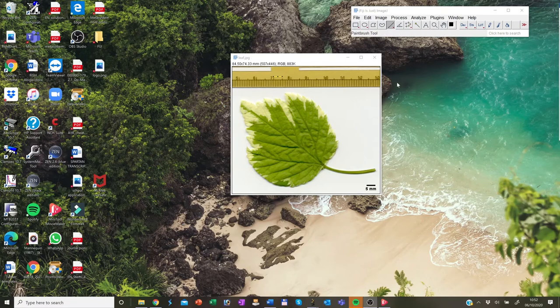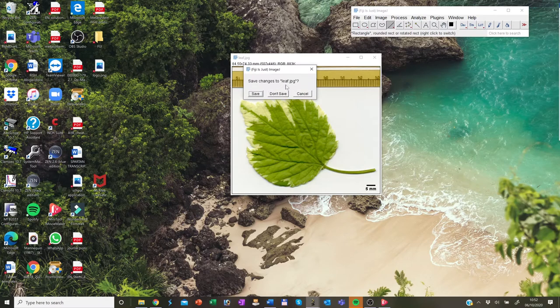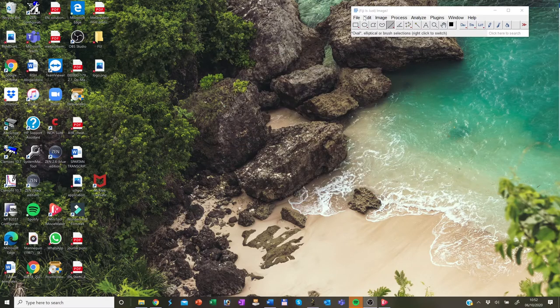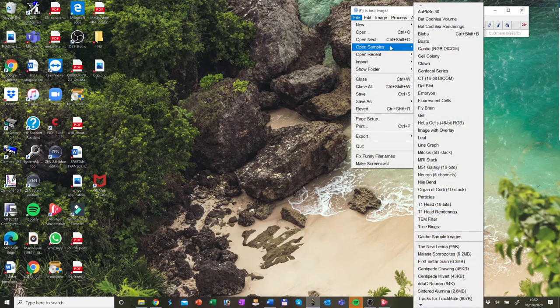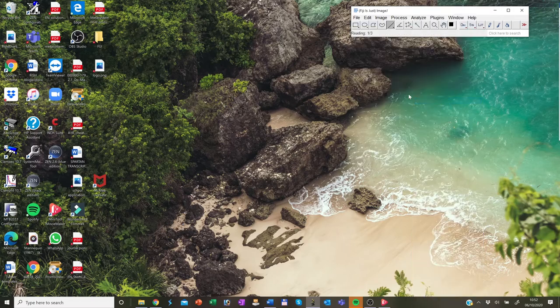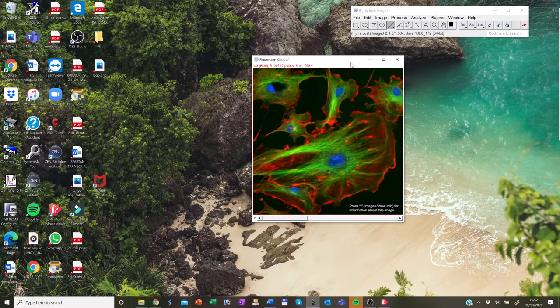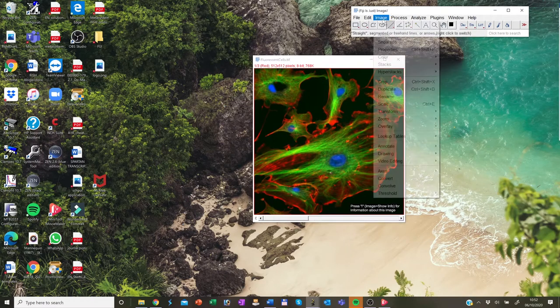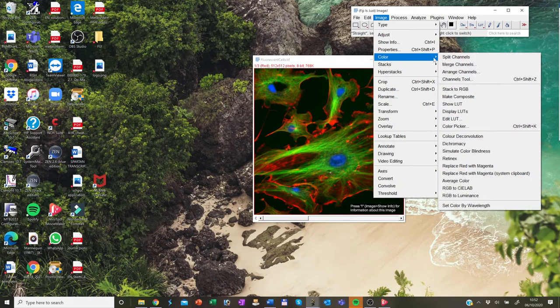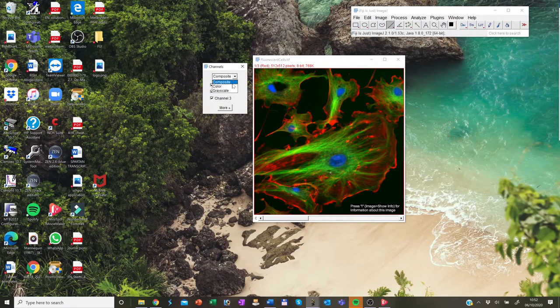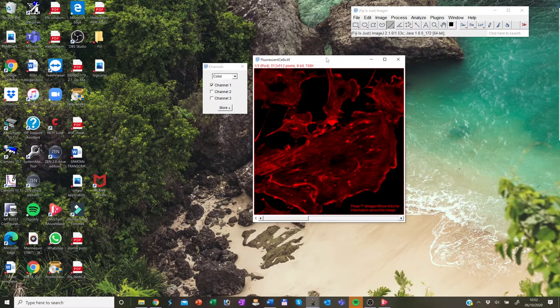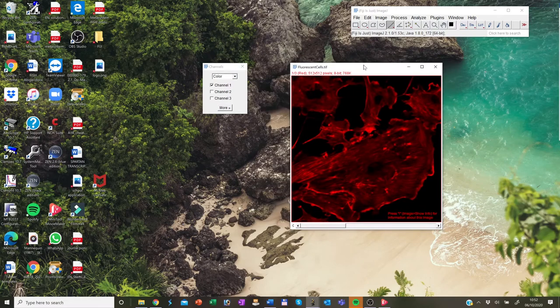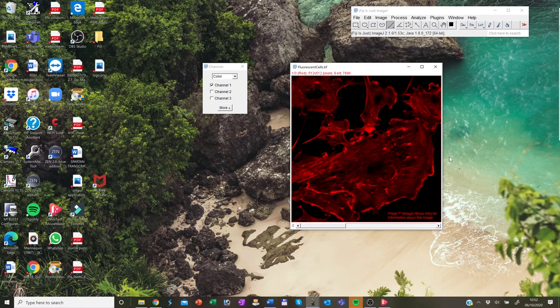OK, now we talk about the lookup tables. First of all, I close that and don't save it and I open up the image of fluorescent cells. Now make sure that the images are not composite but color. So each channel can be assigned to different colors or also to a range of colors if you want to study intensities.